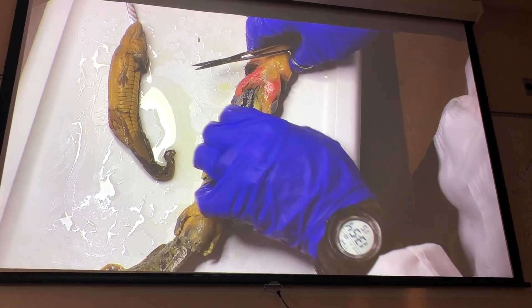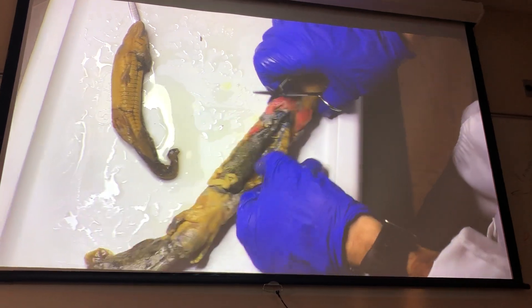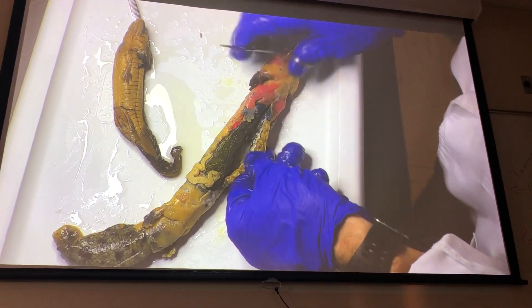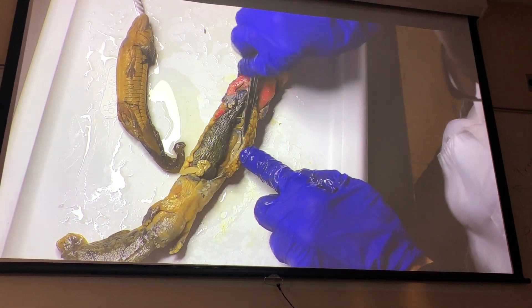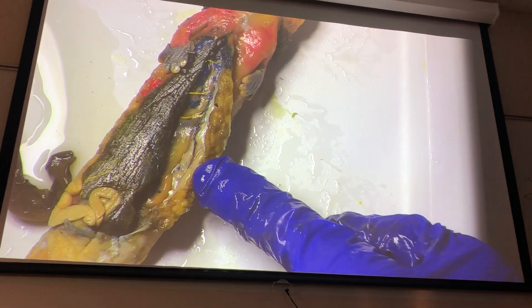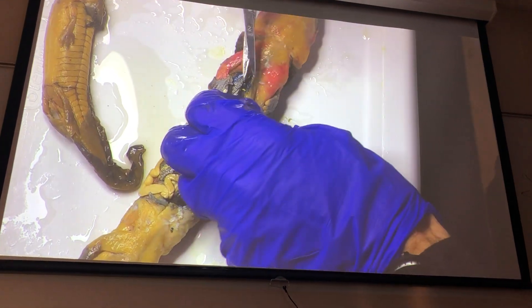Then we're going to do a couple of transverse incisions. Of course everything's a little asymmetrical here because of the way the animal opens up. Remember in lecture talking about the ventral abdominal vein? There it is. I said you're probably not going to lose it when you cut the animal open — but you will.